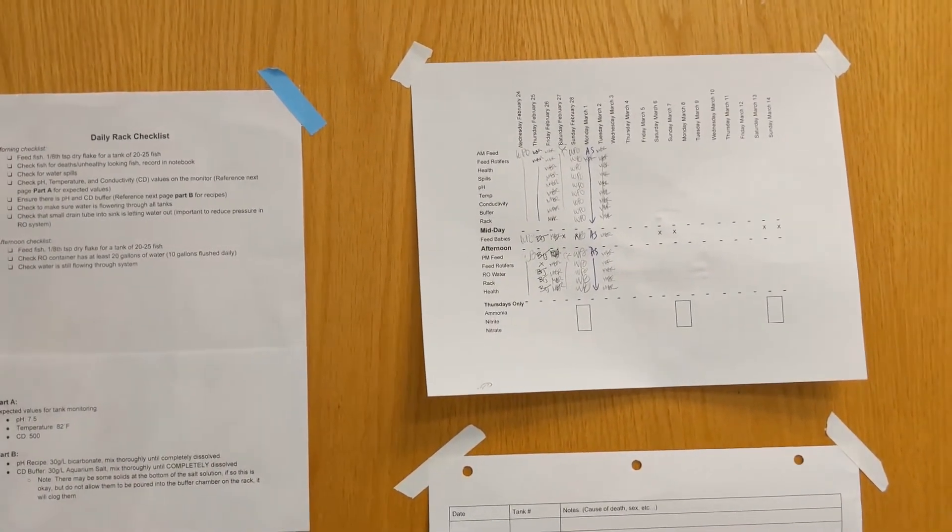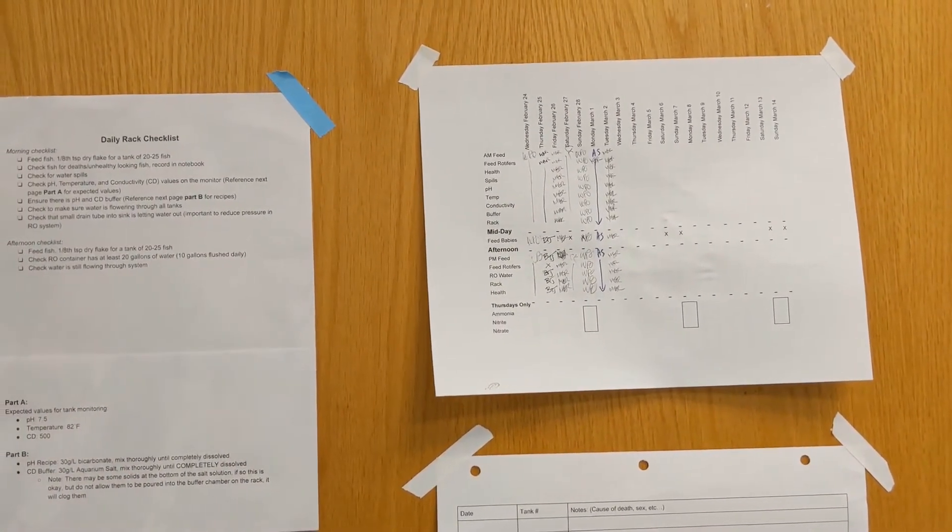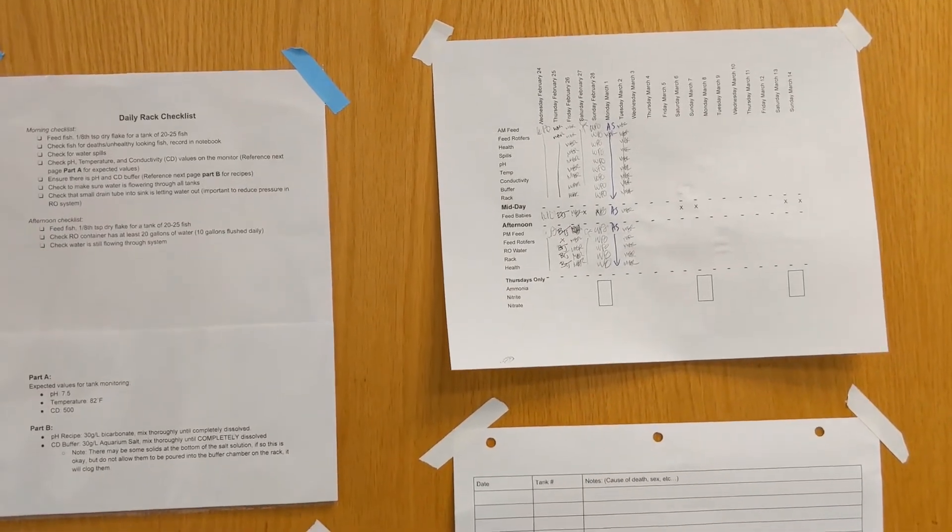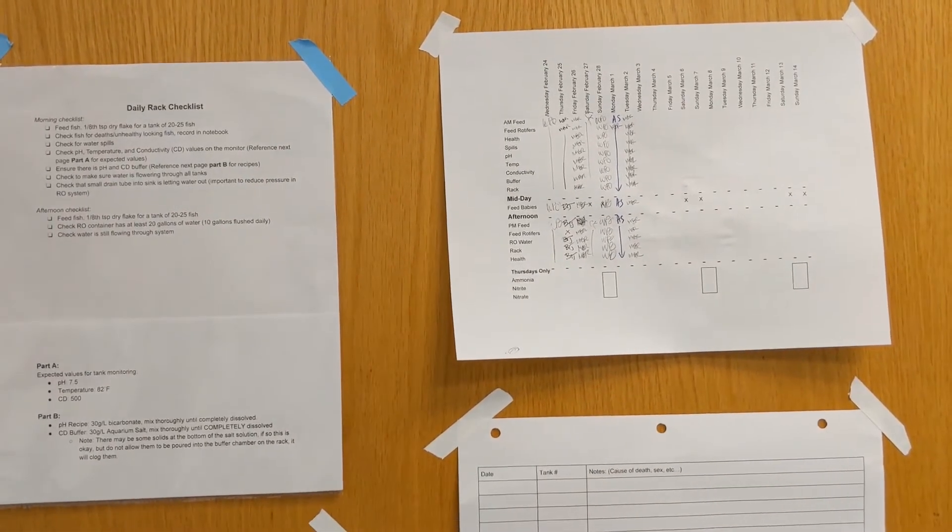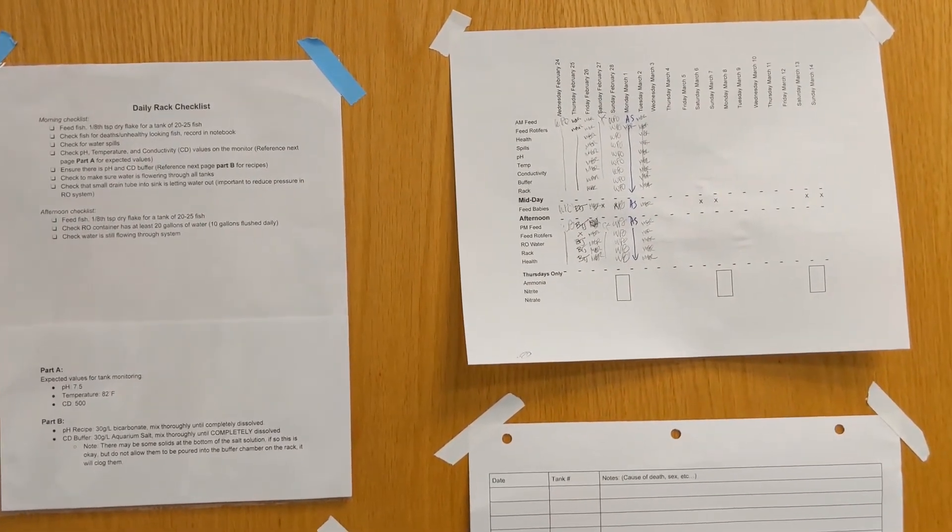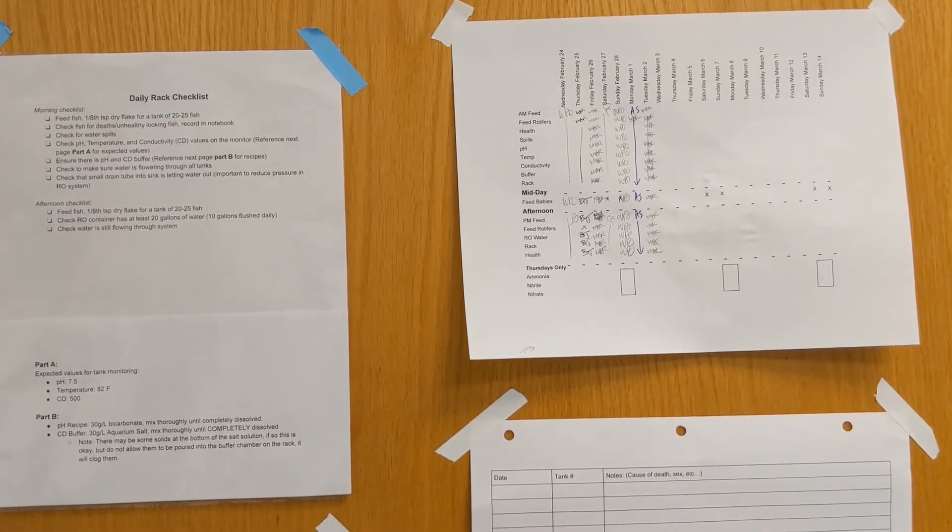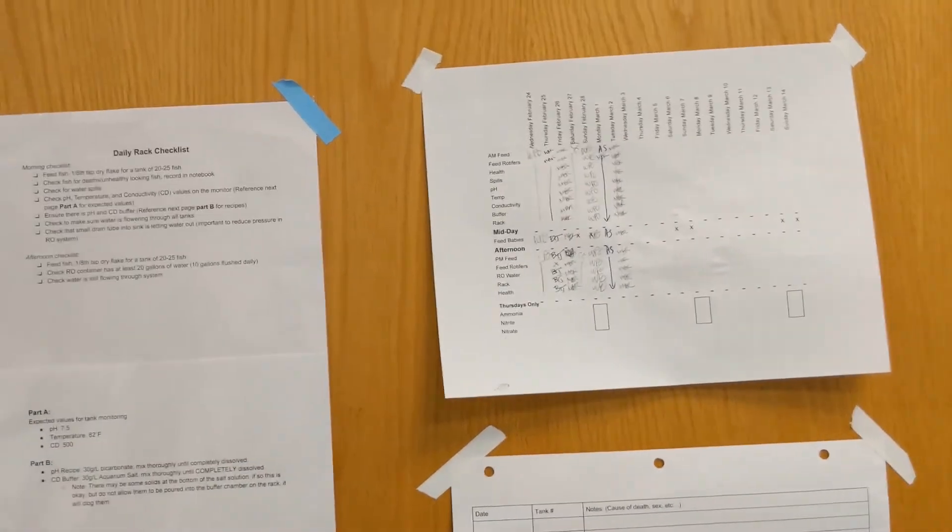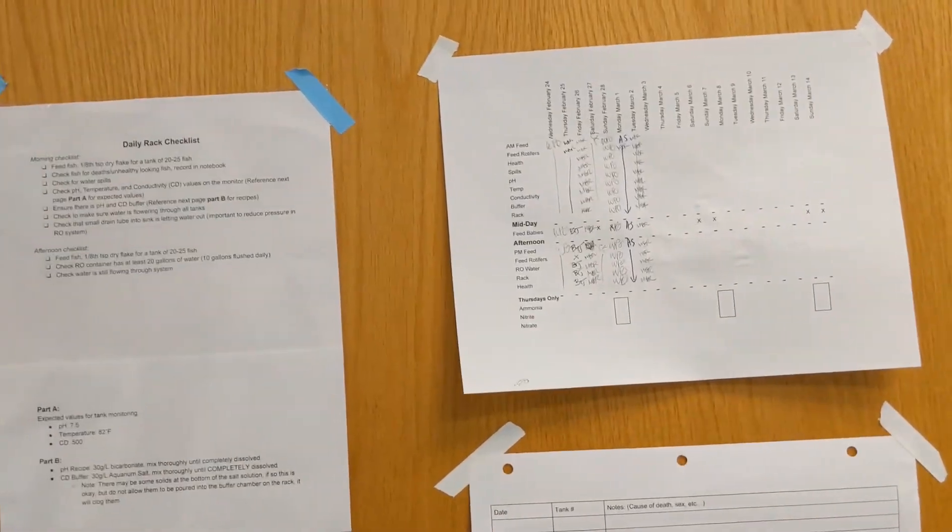We check to make sure that there are no spills or overflowing tanks and we also check to make sure our buffers are full. This is also where we check off when the fish have been fed each meal.